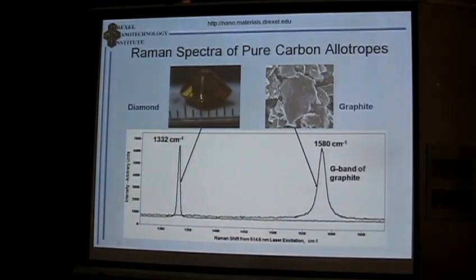And those are widely used. You see the peak for graphite is usually broader than for diamond because of disorder and stronger variations of lattice, some bending of graphene sheets, defects. Perfect diamond crystals give an extremely narrow peak in Raman spectrum, 2 inverse centimeters or more narrow. Both techniques are widely used for both materials. For example, Raman spectroscopy is the only way, as far as I know, to distinguish artificially treated and colored diamonds from natural diamonds. So jewelers do a lot of Raman spectroscopy nowadays.